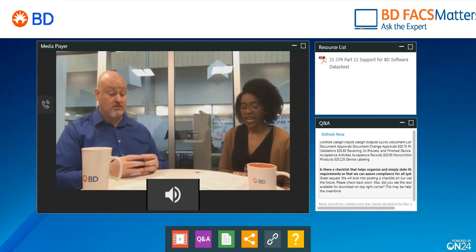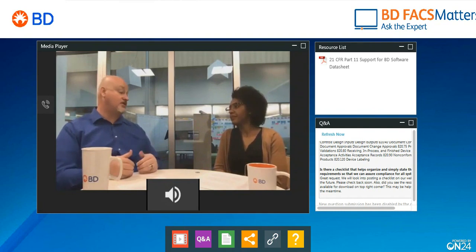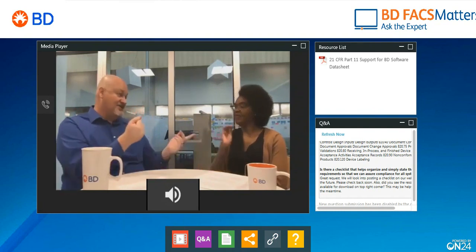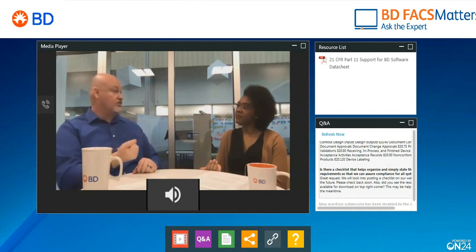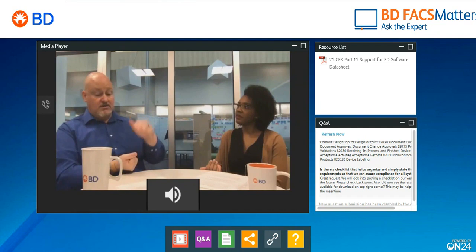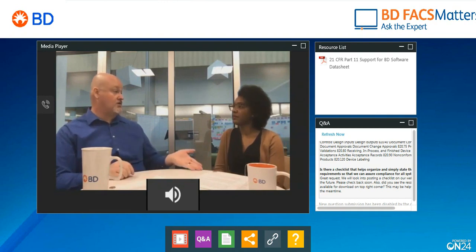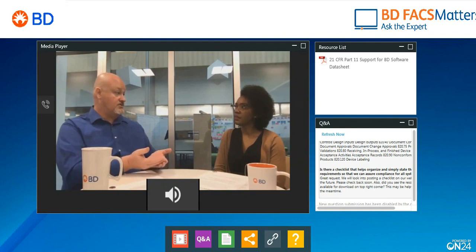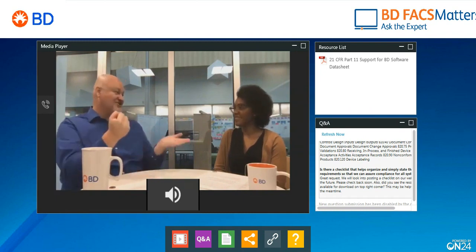Another frequently asked question is, if the application allows internet access, should a digital signature and encryption be used? That's a very good question. So this goes back to open and closed systems. Even if I have internet access, but I maintain control over this data, there's no reason for me to apply digital signature encryption based on the regulation 21 CFR Part 11. Whereas if you are transmitting this data to an open system, you have to apply those controls. So it depends on how you're managing your data. Do you maintain control? Is your fist closed, or is your fist open?